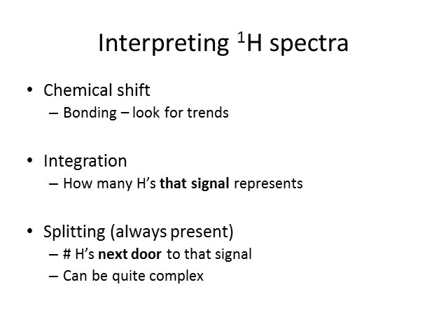Integration, the relative sizes of the peaks. Now this is not just the height of the peak, it's the area underneath the peak. The relative sizes of the peaks is called the integration, and the ratio between the sizes of the peaks is equal to the ratio between the number of hydrogens represented by each peak. Because a peak could represent just a CH, but it could represent a CH2, so it might represent two hydrogens. It might be a CH3. It might represent more hydrogens because you might have symmetry. So you might have two CH2s that are related to each other by symmetry, and therefore that signal will be worth 4 hydrogens.